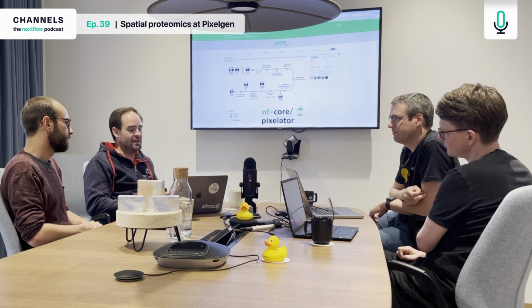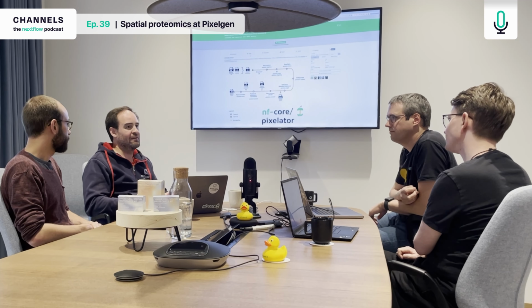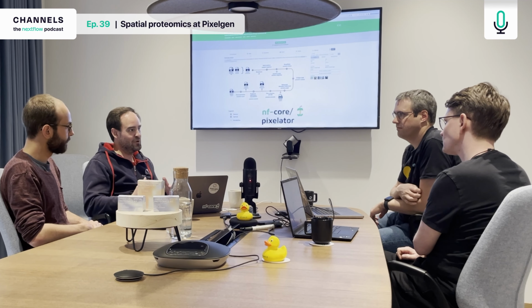And I think that's what we did in the beginning, from these bash scripts that we talk about, thinking about: if we want the mass of bioinformaticians of the world, what do they program in? How can we package that programming language in Pixelator with all the intelligent stuff so people can use it in whatever architecture they are? How can we use that machinery in most of the computer centers in the world and put it all together into an orchestrated pipeline?